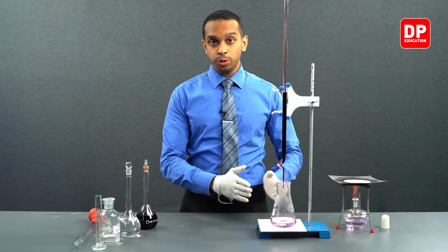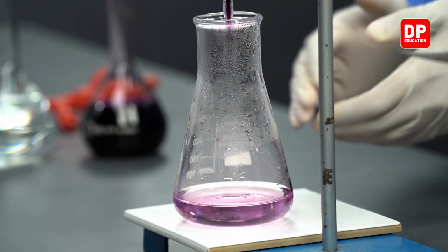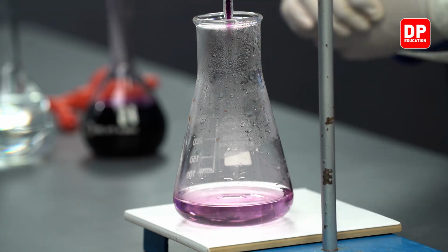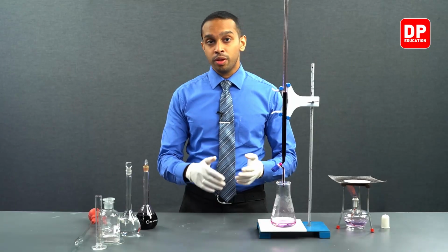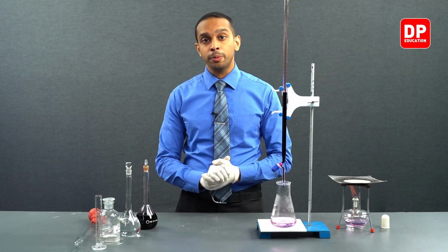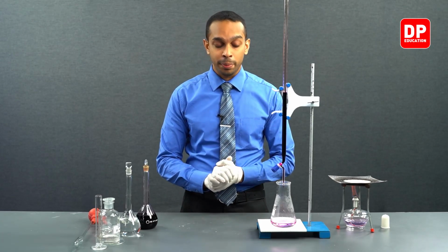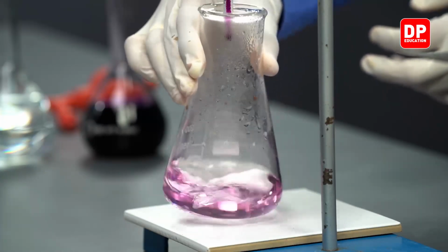Students, now you can see that we are observing a permanent pink color. This color is permanently there due to all of the oxalate anions reacting with the potassium permanganate that we added into this solution. After all of the oxalate anions are completely reacted, the next oncoming drop of potassium permanganate will make the entire solution a slight pink or slight purple color. So at this point, we can see that we have successfully obtained our endpoint.